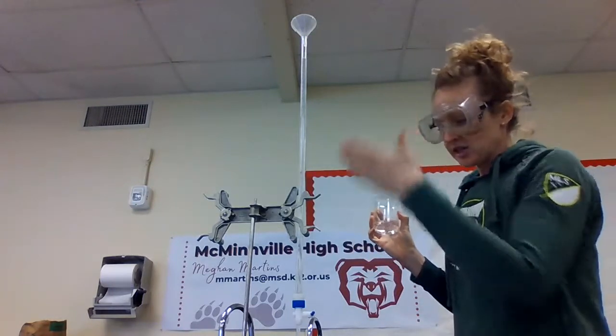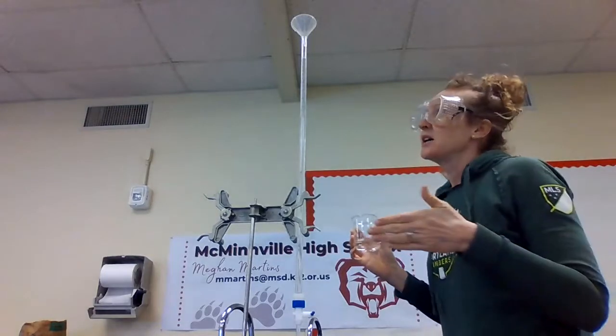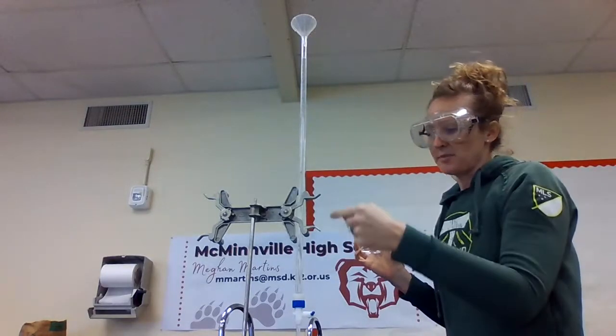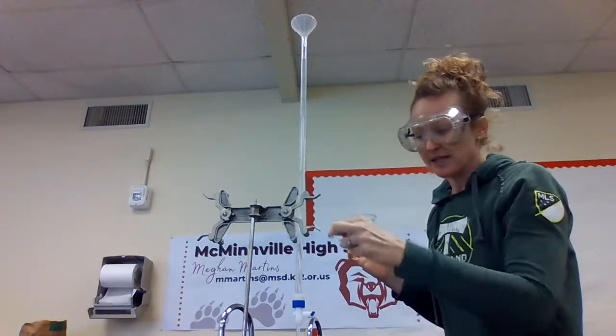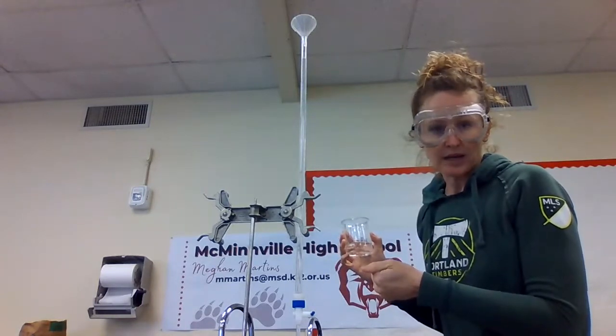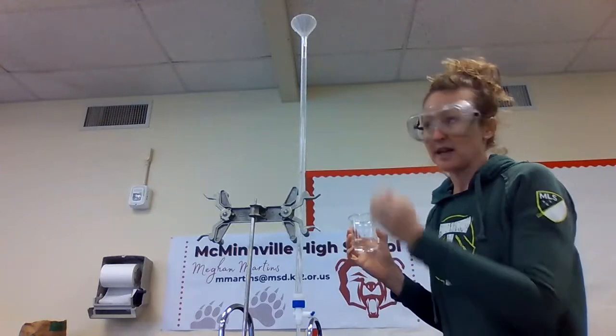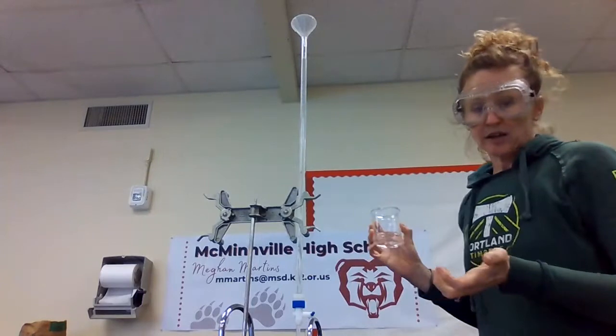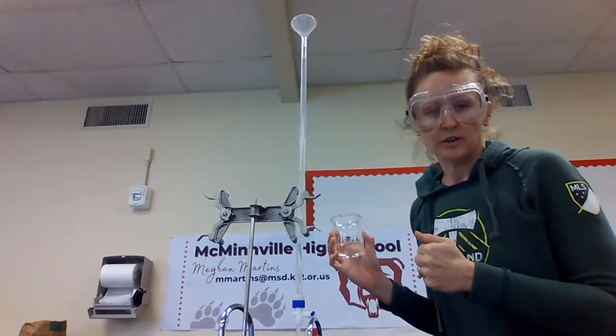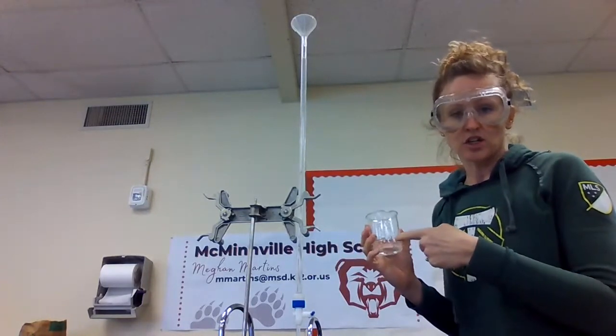Okay, here is titration tip number 2. When you first fill this up with base, you want to do what we call a rinse. You want to fill it up with base and completely drain it out the bottom into a waste container. That's called rinsing your burette. If you don't rinse your burette, whatever is left in there before could affect the concentration of your base.